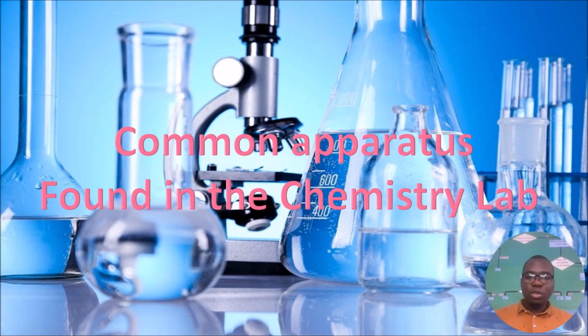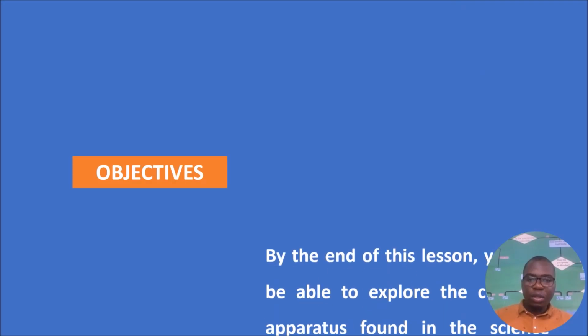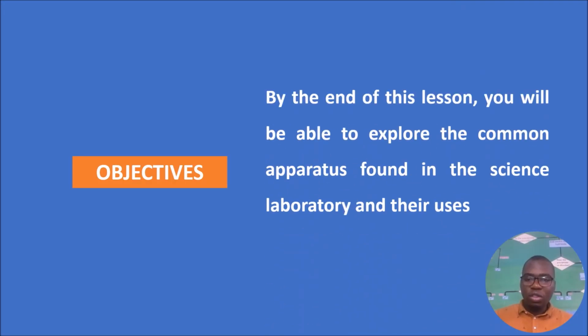Welcome to part 2 of common apparatus found in the chemistry lab. By the end of this lesson, you will be able to explore the common apparatus found in the science lab and their uses. Let's look at the flasks.